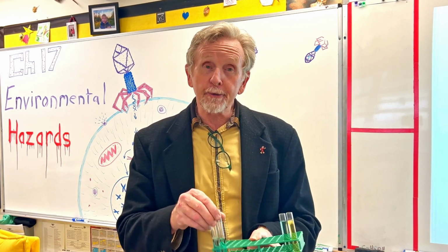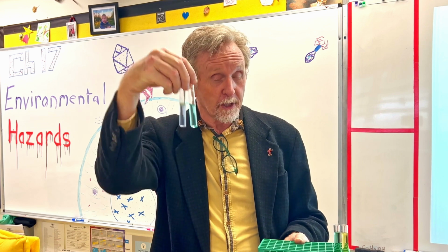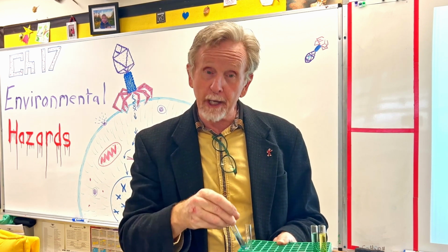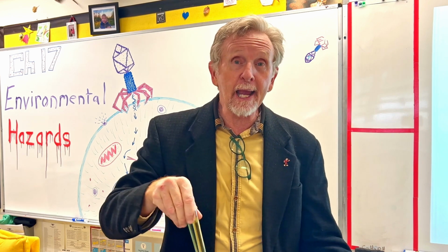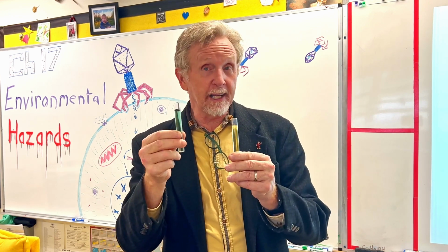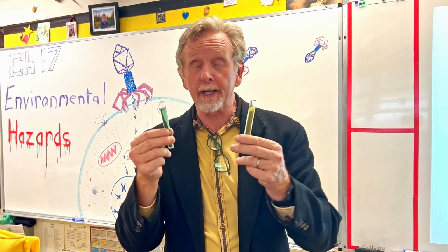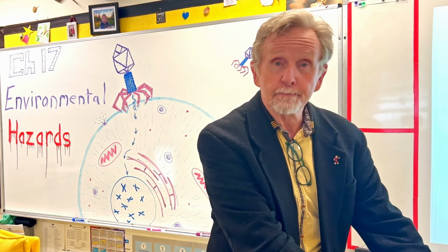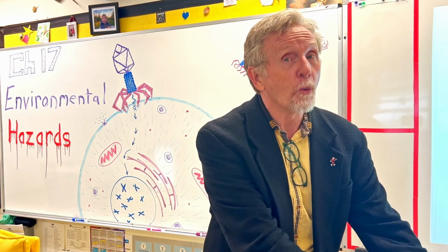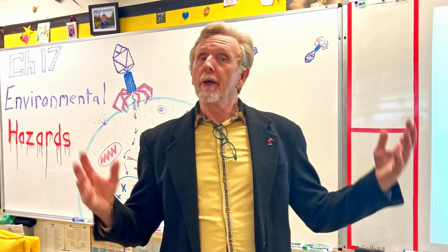Now, we definitely saw some differences with our nitrites. Nothing got into the really dangerous levels, but we see those nitrites building up in one of the samples. And then with our pH, one is getting into that kind of slightly basic and the other a little bit slightly acidic. So both local water samples, but we get some different values from it. And turbidity, once again, based off what you were able to determine from the video. Anyway, that should wrap it up.